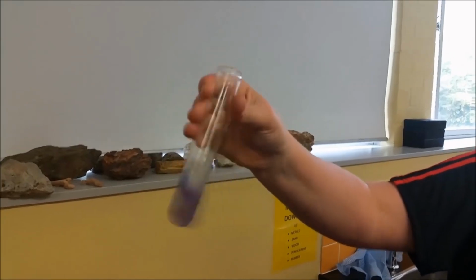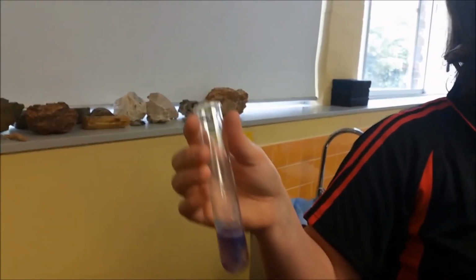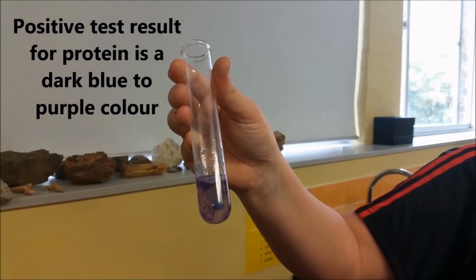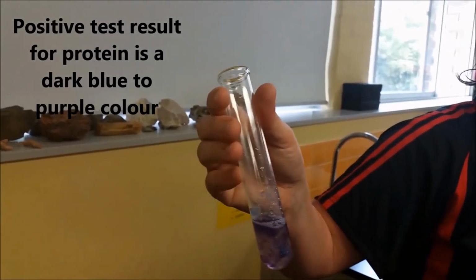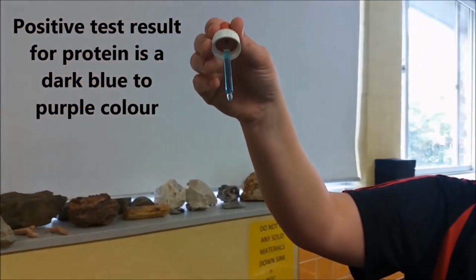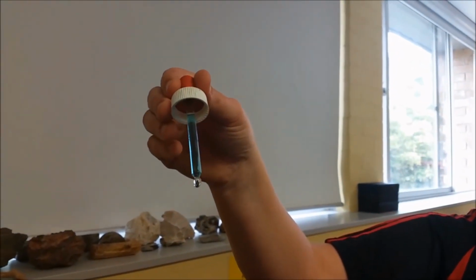When you add the copper sulfate solution, you see how the colour changes. It'll automatically go blue because the copper sulfate's blue. If protein is present though, it will go either, now this is because this is a strong solution, it has gone quite purple. However, it can go quite a dark blue. Alright, so I'll just show the copper sulfate again. Can everyone see the colour of the copper sulfate? And you guys have used that before.